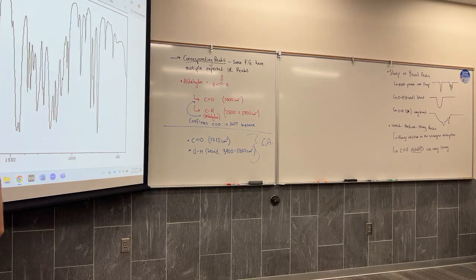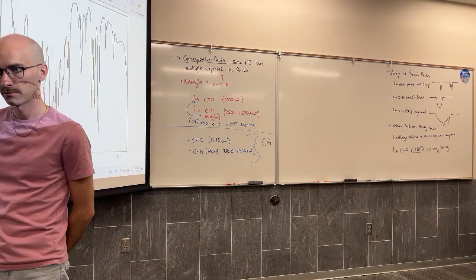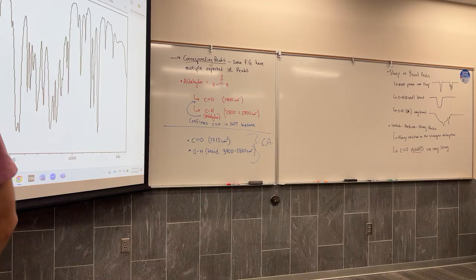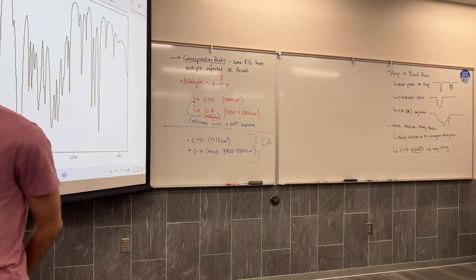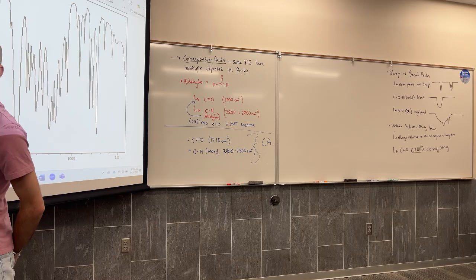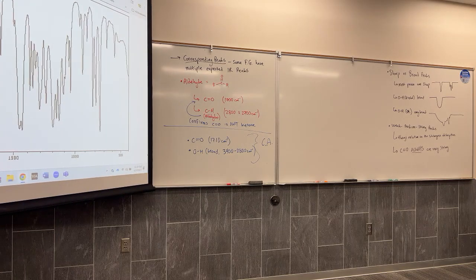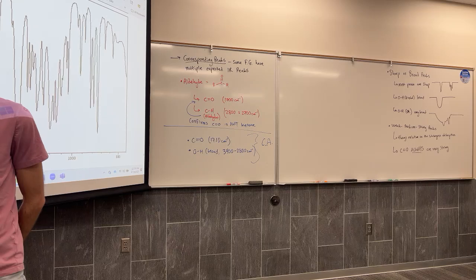Remember, this is a really nice line if you're looking both left and right of it. Carboxylic acid is too broad. Carboxylic acid looks like this, going down. Oh, right, okay. It comes down and stops.